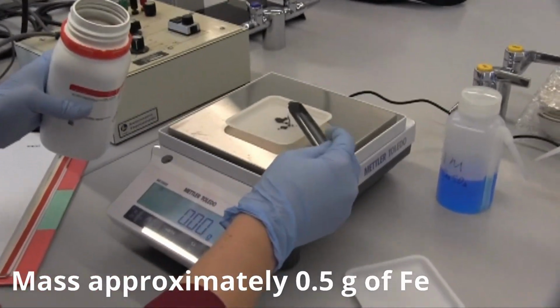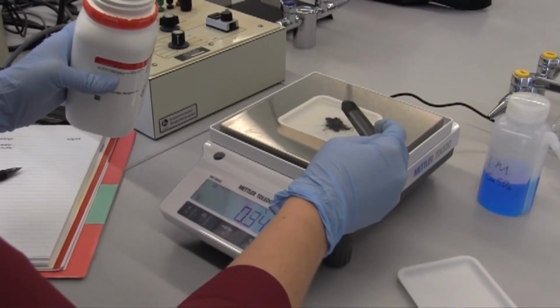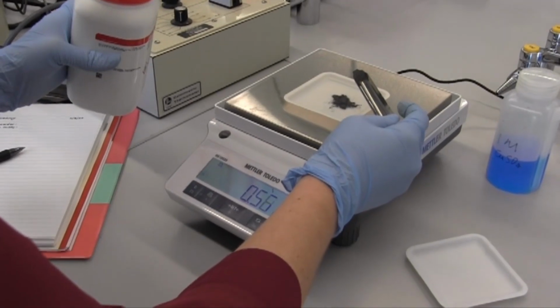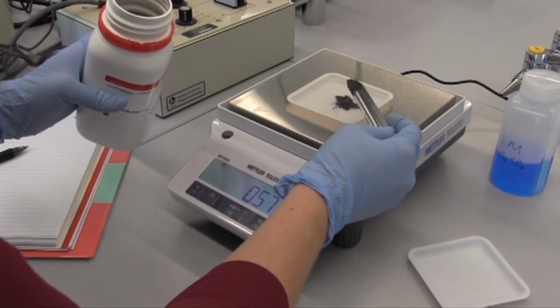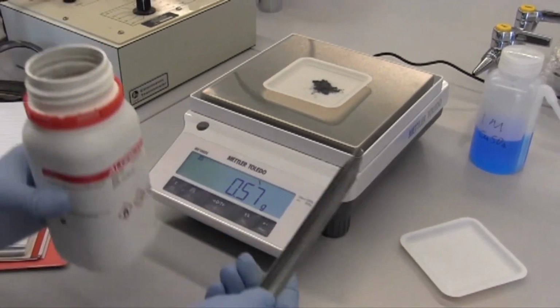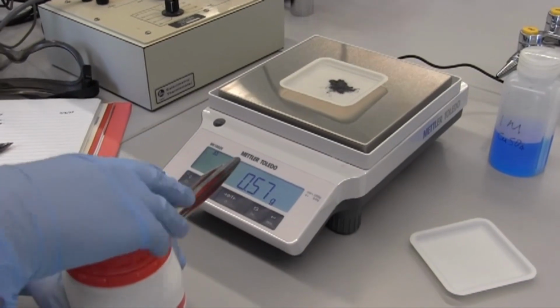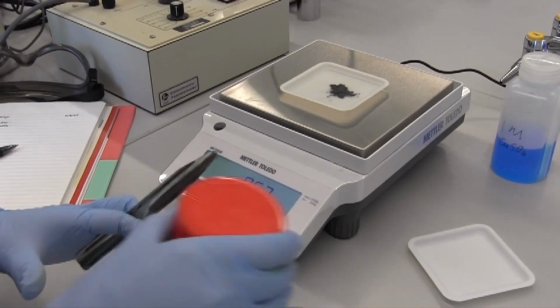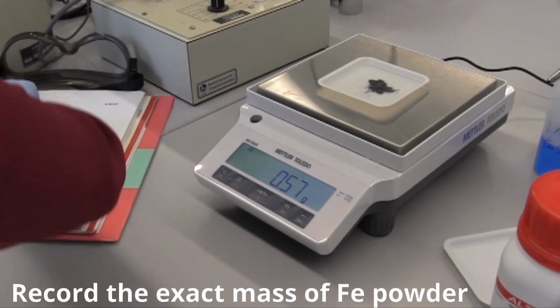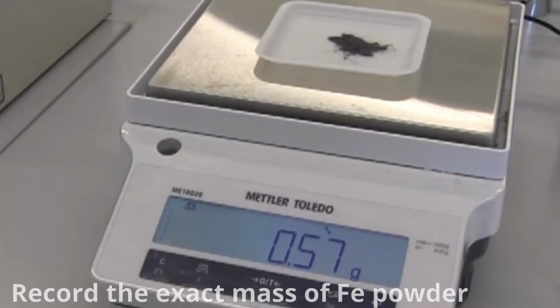Begin by massing about half a gram of iron powder onto a weigh boat. Be sure to record the exact mass of the iron powder in your lab notebook.